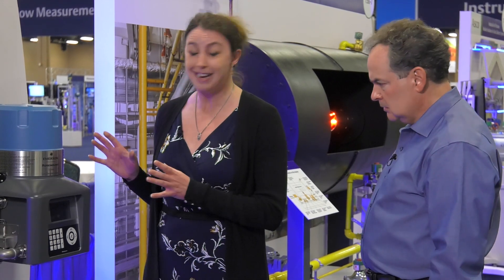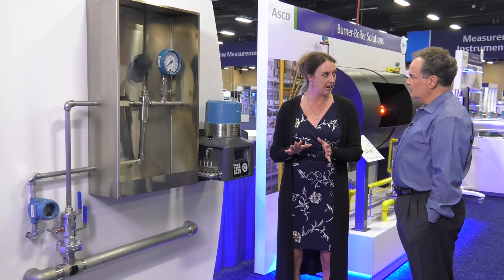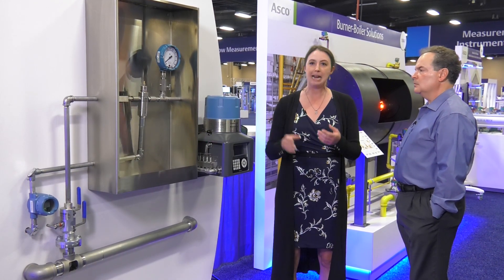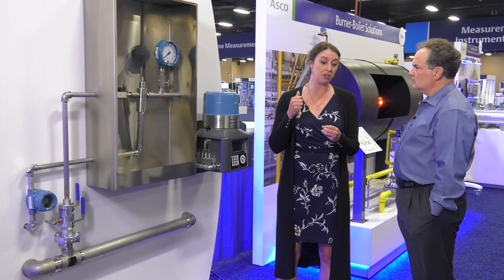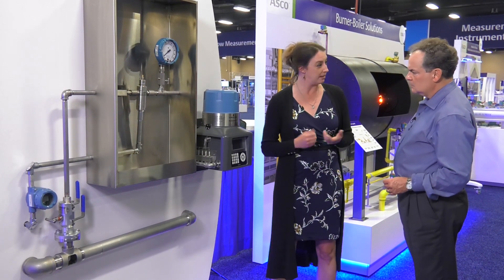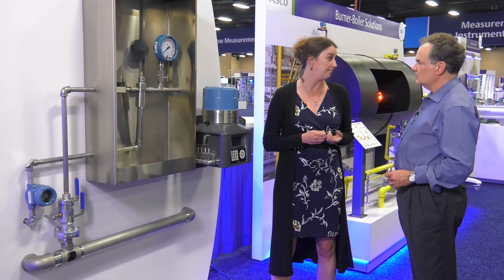Let's talk about the source. What's causing those inaccurate results? Well, this is a gas chromatograph, and a gas chromatograph is designed to analyze gas. It's a highly accurate but sensitive instrument. What happens is in the sampling conditioning system, not enough heat is delivered to fully vaporize the sample. So your heavy components in the gas condense out. That leads to your gas sample being inaccurate or not representative of what's going through your process line. And it also leaves liquid in the line, and the liquid can contaminate the gas chromatograph. All of that results in those inaccurate results costing time and money.